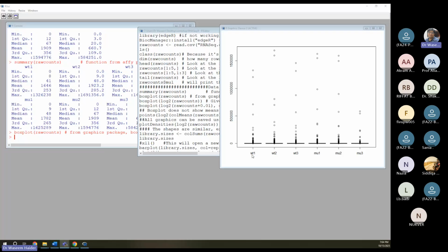Well, type 1, 2. What do you see on the x-axis? Are there sample IDs, names? On the y-axis, the range of numbers. Since we have very big numbers in the data set, something like 1.6, what is that? I guess 1.7 or 1.8. Yeah. How would you read that? 1.5 is this, and then this next one can be 1.7 million.